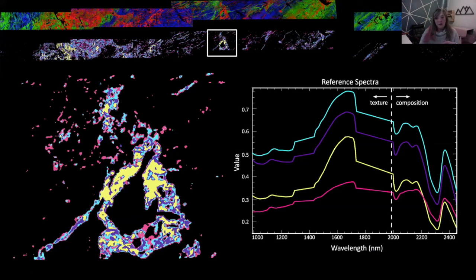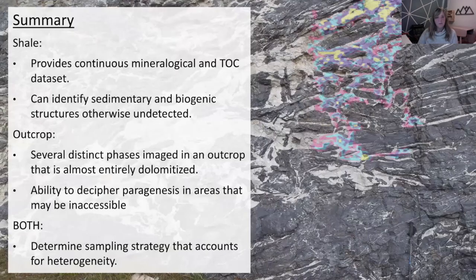And the pore lining pink phase, from the ChemScan data and microprobe data we have so far, shows that we can validate this and say that it's more magnesium or iron poor. So we've started doing some analysis like that. What we are also hoping to do is we've subsampled in a number of these regions and then scanned the hand samples. And we hope to run some very detailed geochemical analysis on that. Kathy and I have a new PhD student, Cole McCormick, who's working on some of this for his PhD.